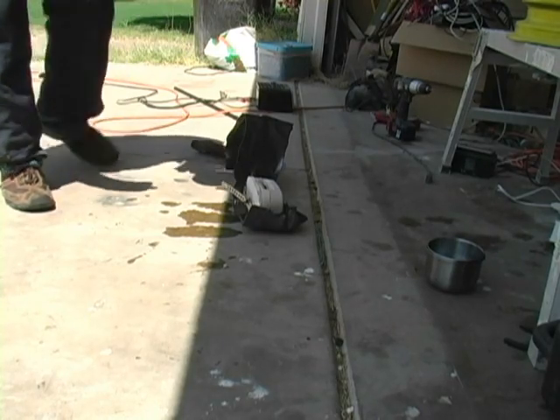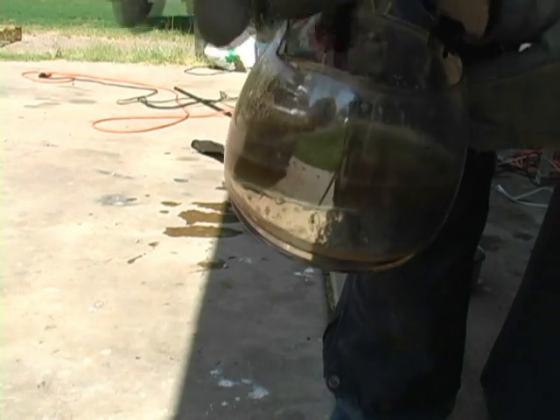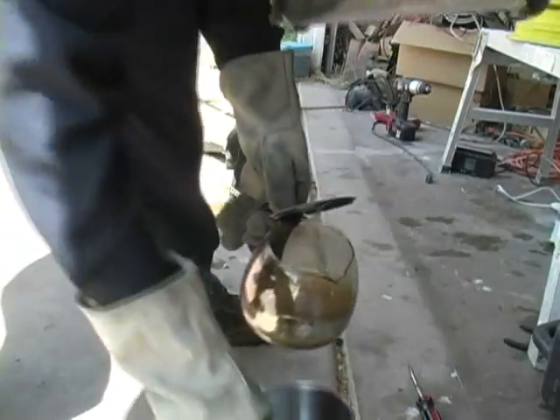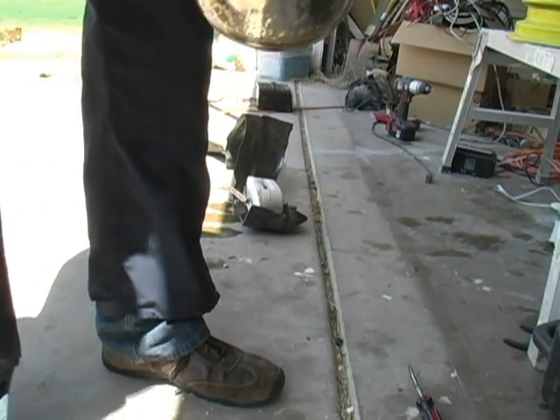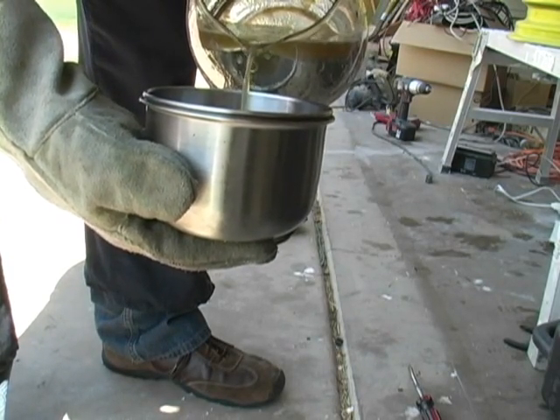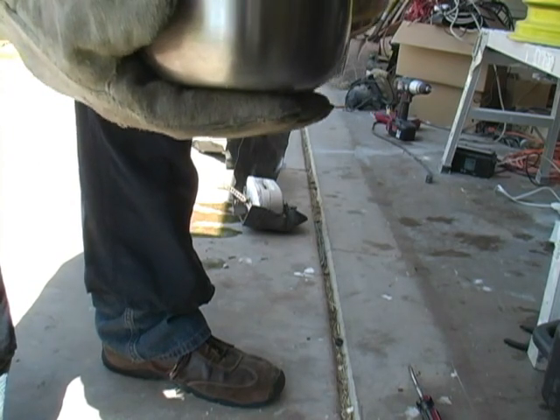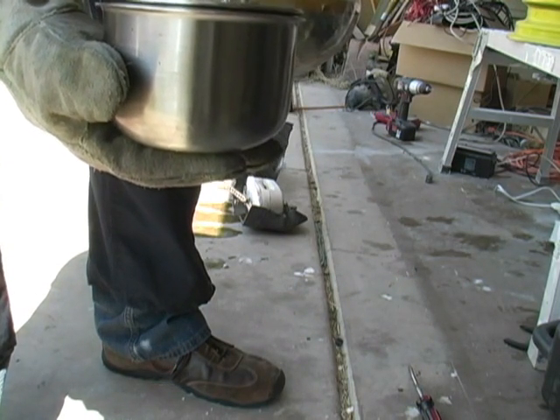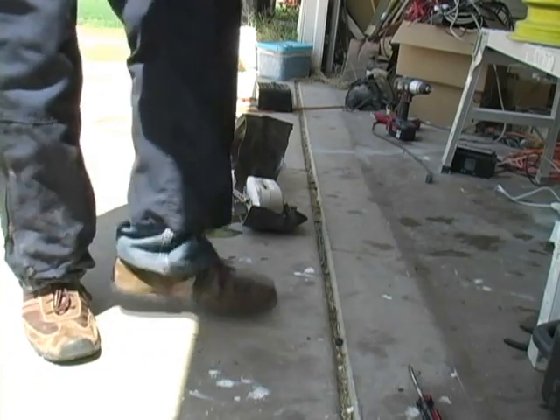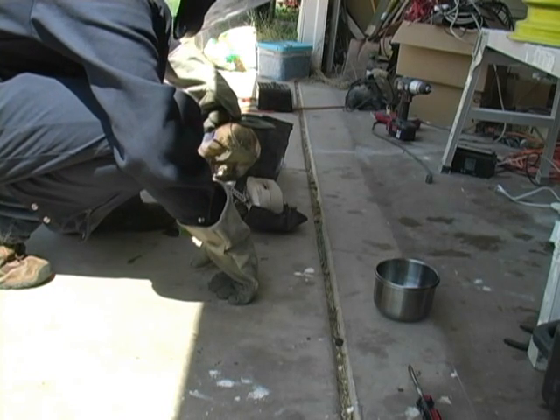So I've re-melted it, and I'll give you a close-up of what it looks like. I'm going to pour off into this first. I want to get rid of that hydraulic fluid so we don't have the same problem with it beading up, hopefully, on the second time. I also went ahead and heated it up a little bit farther.